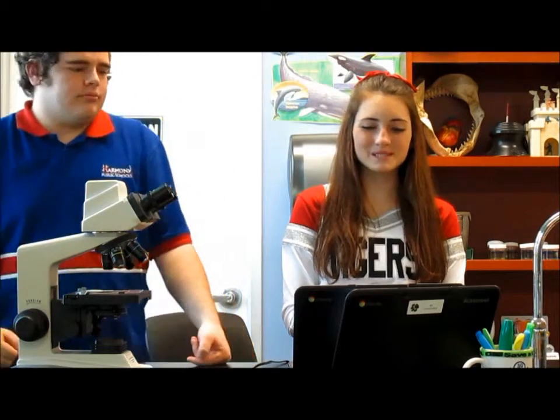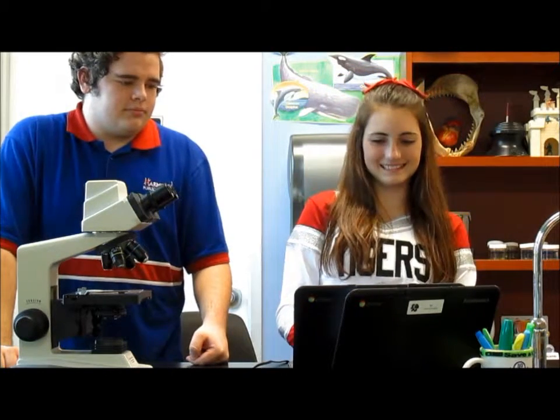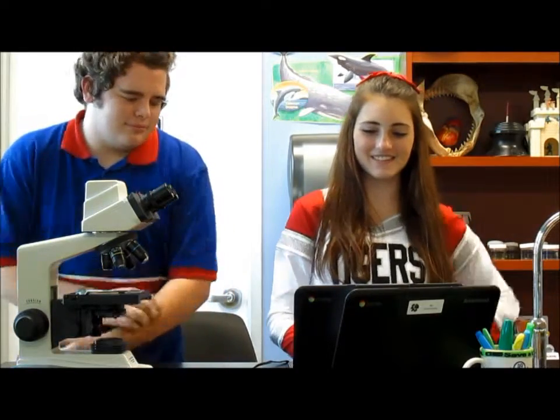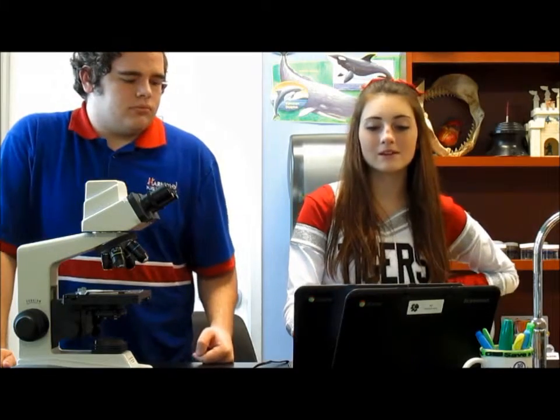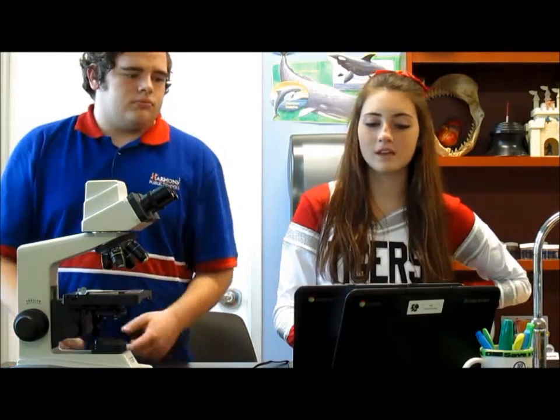A microscope is an optical instrument having a magnifying lens or a combination of lenses for inspecting objects too small to be seen distinctly in detail by the unaided eye. The microscope helps us overcome the limitations of our own eyesight, such as things being too far away or too small, or beyond our ability to observe without some sort of device's help. Just like the telescope was critical to astronomy, the microscope was critical to biology.